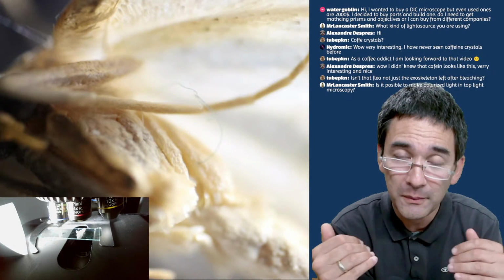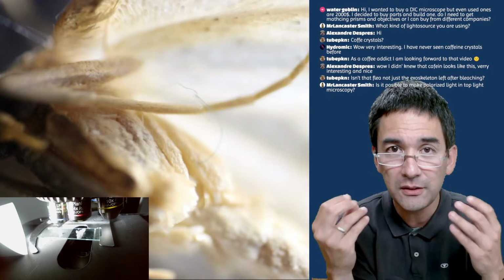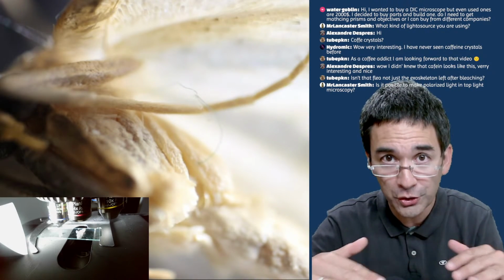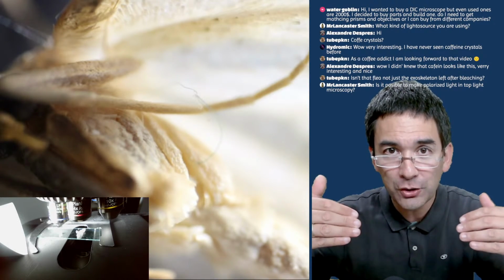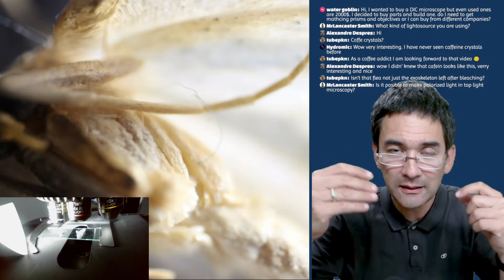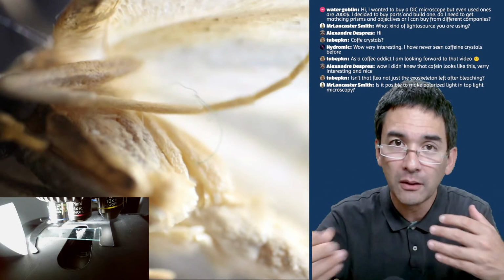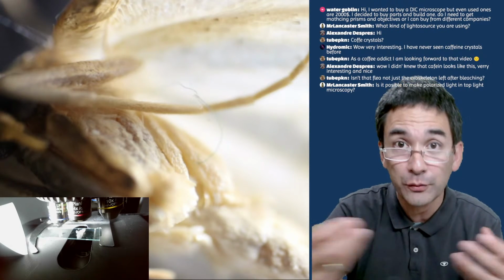For example, polarizing sunglasses: when you look at a non-metallic reflection, like the sun reflecting off water, the polarizing sunglasses are able to remove that reflection so that you're not blinded as much. But you have to actually look at reflections.